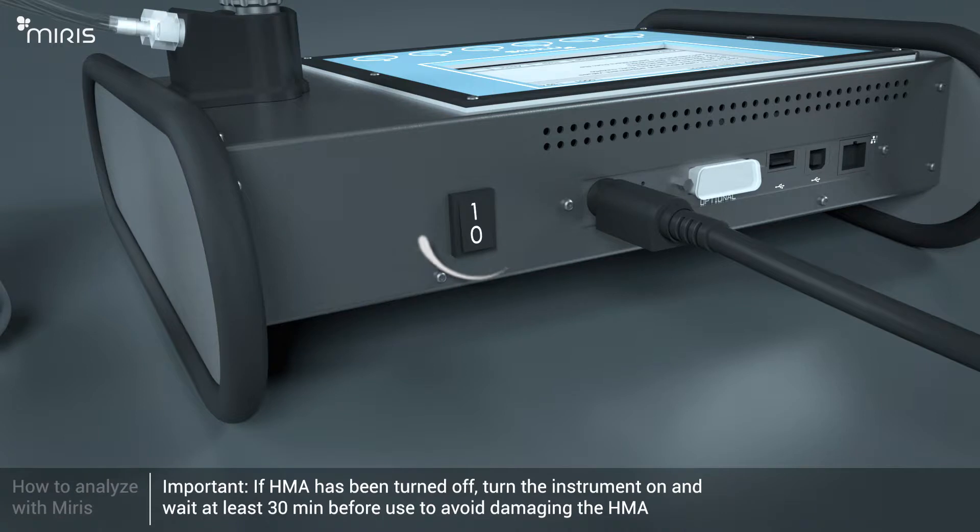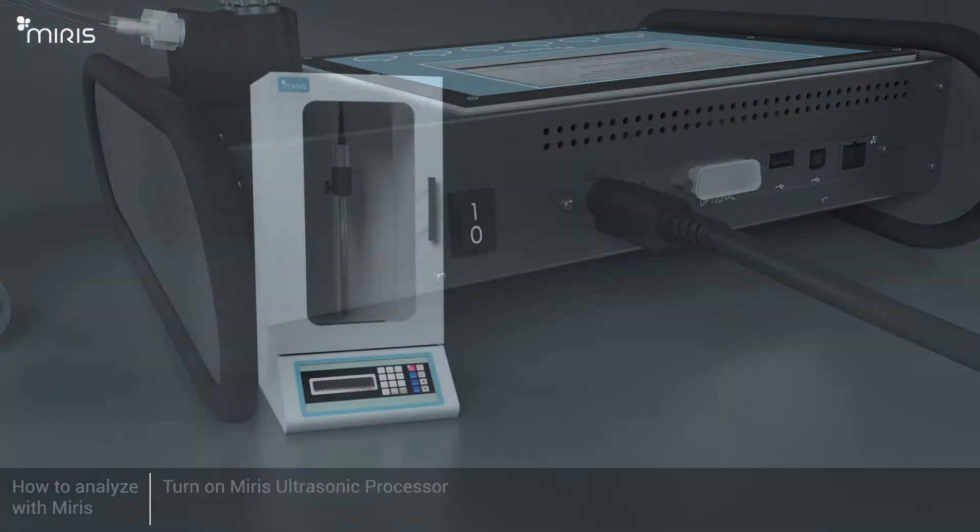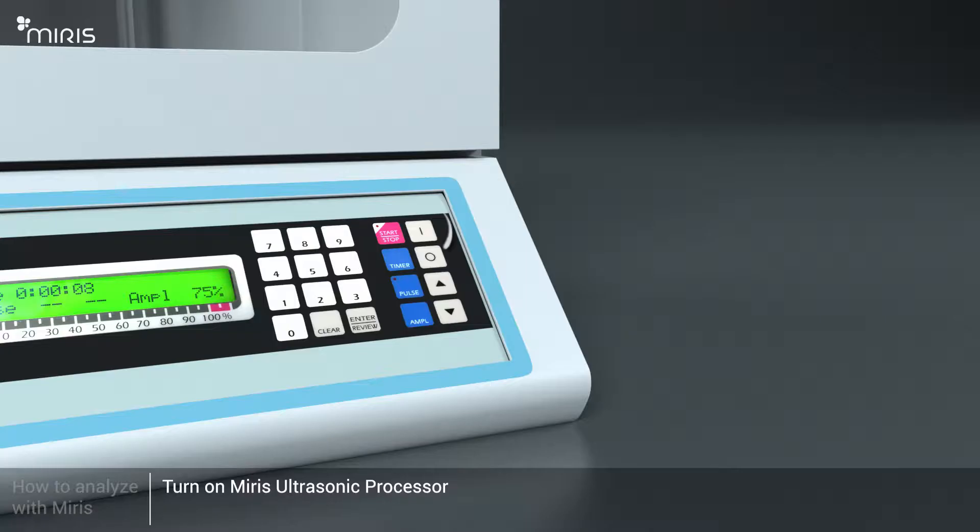Turn on the Meris HMA and wait at least 30 minutes before proceeding. This action is necessary to avoid damaging the Meris HMA. Then turn on the Meris Ultrasonic Processor.